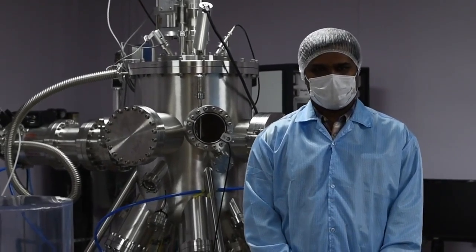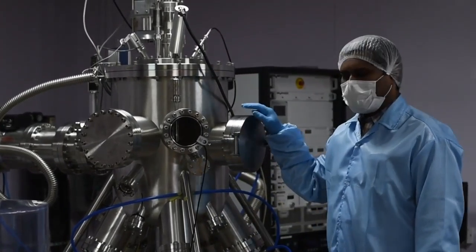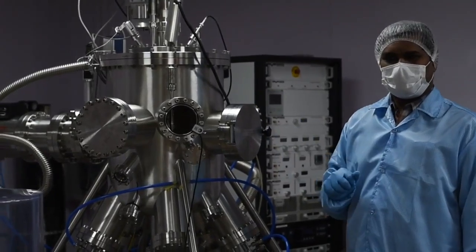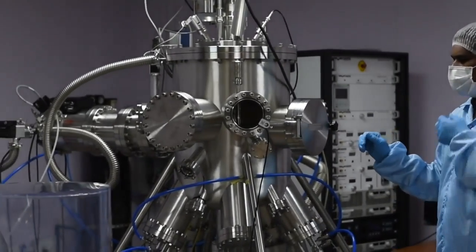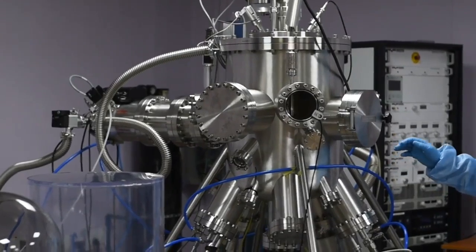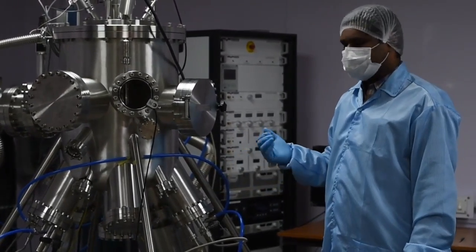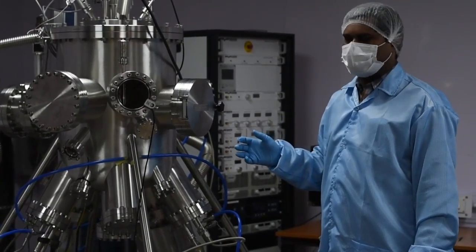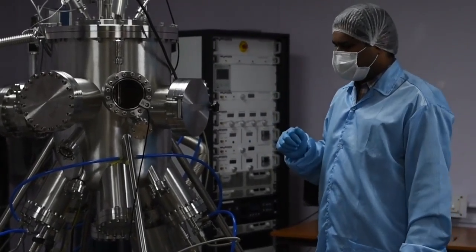I am a research scholar from the Center for Nanotechnology. I am going to explain the operation of an RF sputtering system. Sputtering is a technique in which high-energy ions strike the surface of a target material and eject atoms from the surface. These ejected atoms then deposit on the substrate.